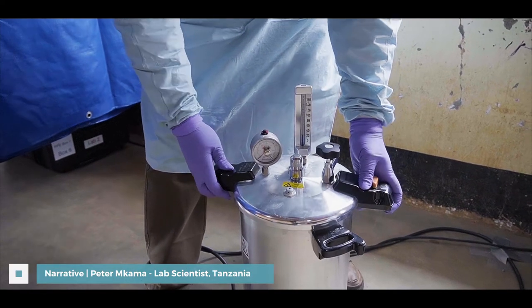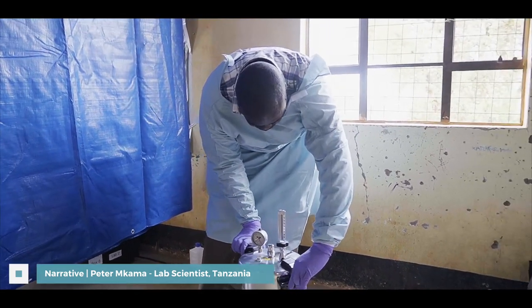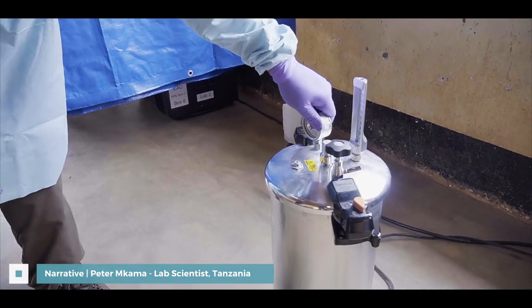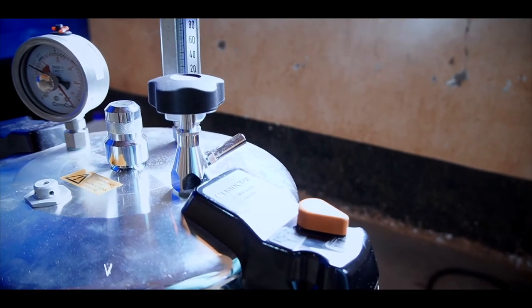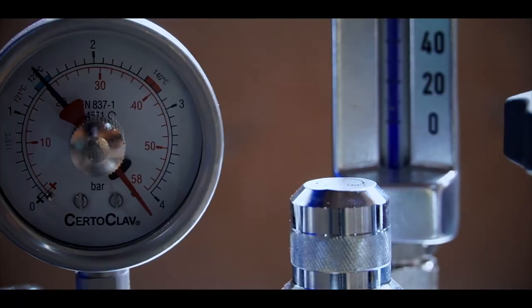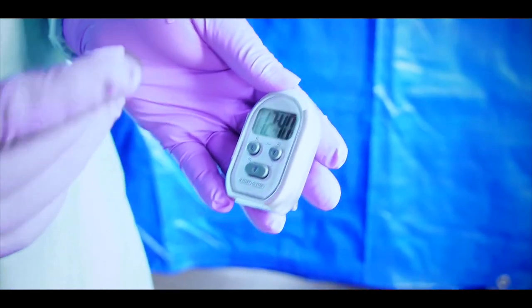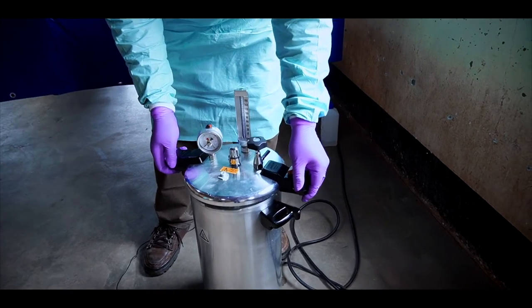In this section we do autoclaving. All waste before leaving the lab has to be cleaned, and the process of cleaning the waste is called autoclaving. The waste is taken and sterilized using steam at 120 degrees centigrade under pressure for 15 minutes, after which it is safe to be incinerated.